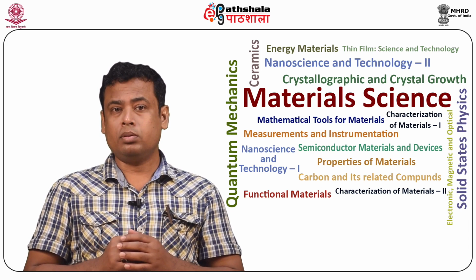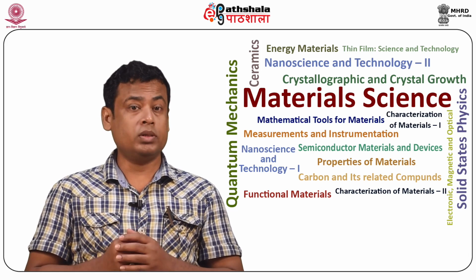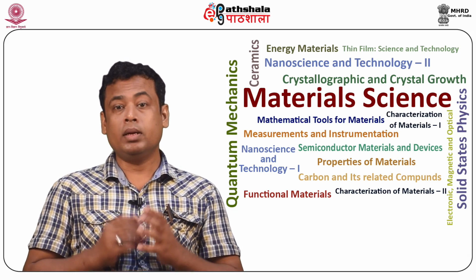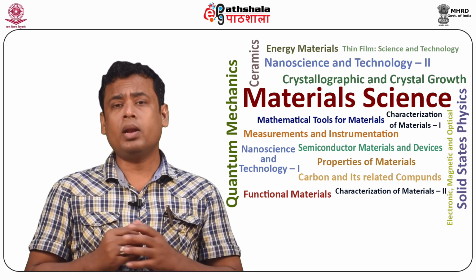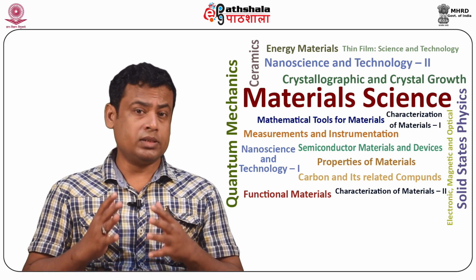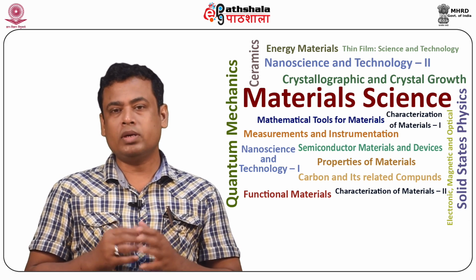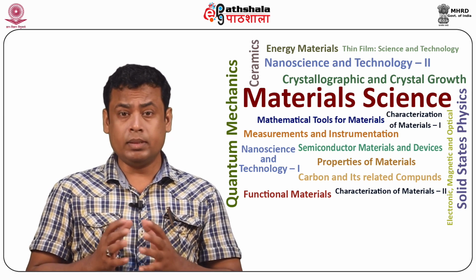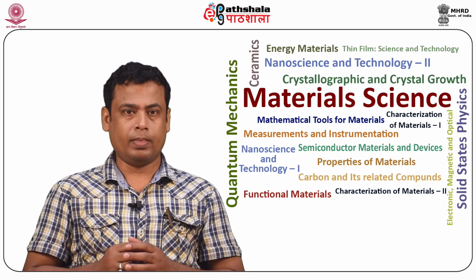The cantilevers for this mode have a high spring constant of 20 to 100 Newton per meter, so that they do not stick to the sample surface at small amplitudes. The cantilever oscillates near its resonant frequency, nearly equal to 200 kHz, to improve sensitivity. The tips used for this mode are silicon probes.